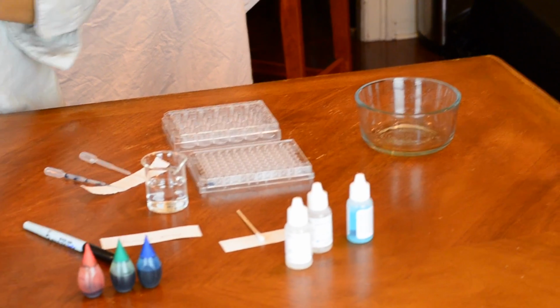Okay, so now everything's been applied to the paper. It's important to let it dry in between drops, and the reason is that if you apply 1 drop, especially of your copper nitrate, lead nitrate solution, the drop spreads out when you put it on the paper. So if you let it dry in between, you will minimize that spread. If you just keep adding your 5 drops one on top of the other, it would spread right across your paper and not make it very useful to read once it's done.